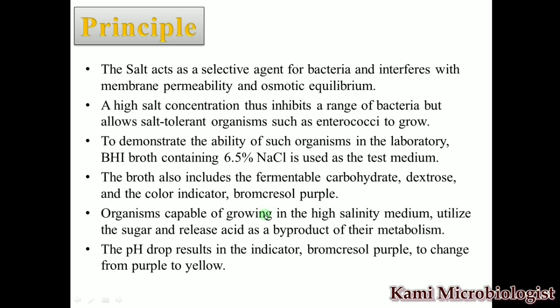Now after inoculation of the bacteria in this media, what will happen? The bacteria will utilize the sugar and will survive in a high salt concentration. The bacteria will also release a product due to which acid will be released and the media color will change. The pH will drop and the color will change from purple to yellow.